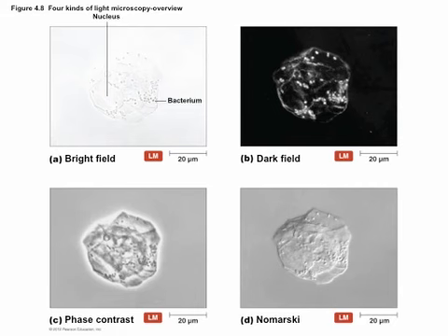This is a standard phase contrast image. This is what's called a Nomarski phase contrast image. It's using a very similar technology, but instead of making the outer edges glow, this is going to contrast the stuff on the inside by giving it a three-dimensional appearance. This is not a true 3D image. It's a trick of the light. And what looks like it's three-dimensional is telling you this is where there's a boundary between something and something else. But it sort of looks like these are bacteria kind of floating on top.